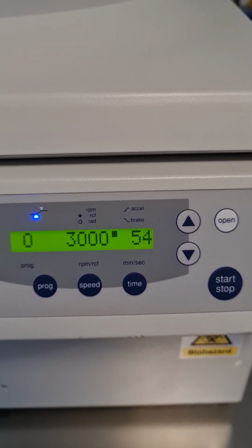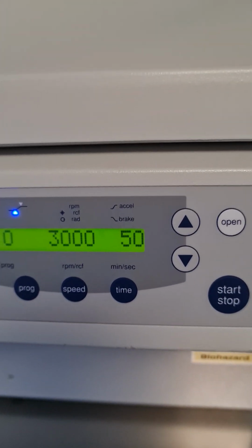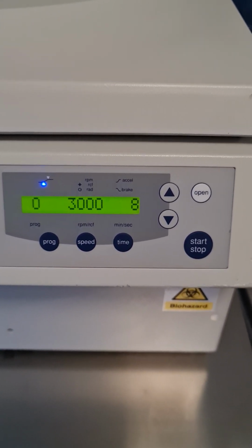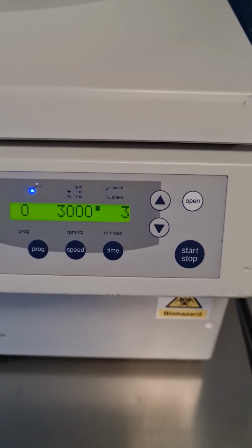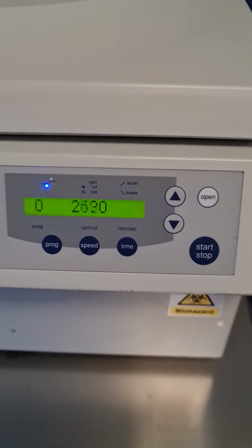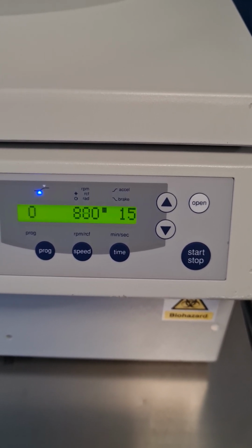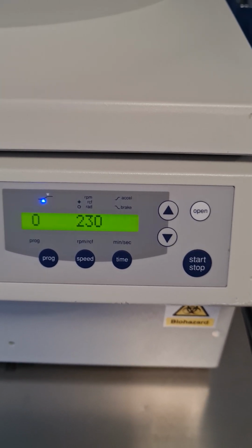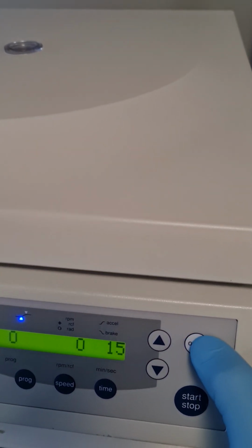Now we are approaching the end of the spinning cycle. 54 seconds left, 52. Last 10 seconds of the spinning cycle. Sample spun. We'll just open the centrifuge.